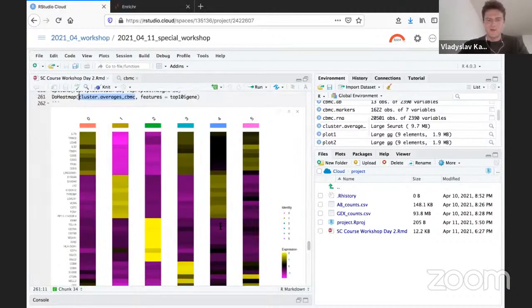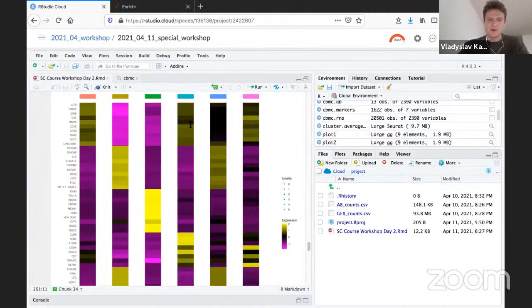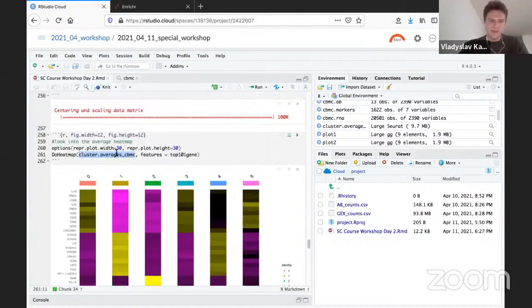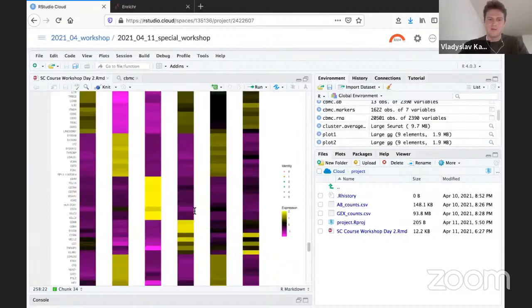And when you're moving forward, just take a look into your markers. For example, CD3, you can see it here. It's CD8 positive, CD8A positive, and so on. So it's something that will basically tell you about the CD8 positive T cells. You can manipulate the size of your plot inside of the chunk, as you can see here, with figure width 12 and figure height 12 in that case. So you can precisely predetermine how big your plot will be.